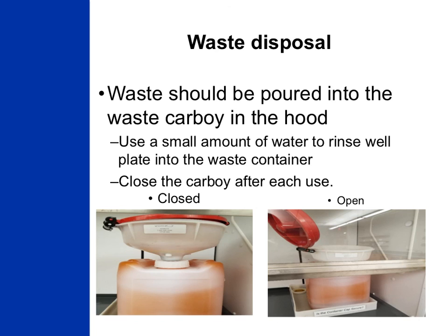As we are working with aqueous acid-base solutions, please make sure you pour all of your waste into the waste containers in the hood. As always, check and make sure the lid to the waste container is open before you pour in your solution. If you have any questions or need help, please make sure you speak with the TA in the General Chemistry Learning Center or ask the lab supervisor if you have questions about the procedure you're performing in the lab.